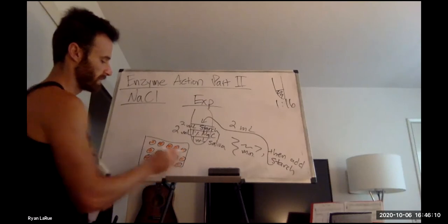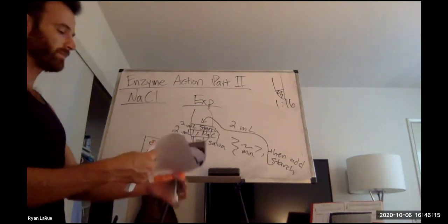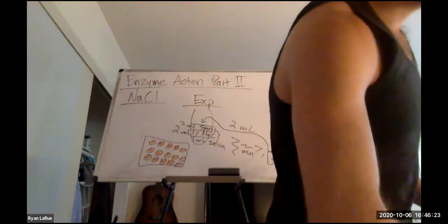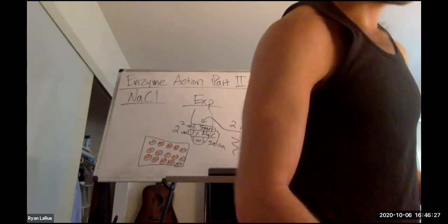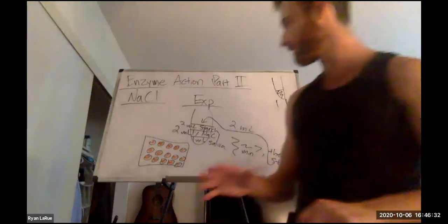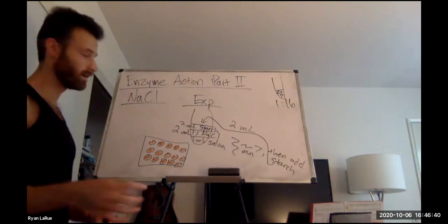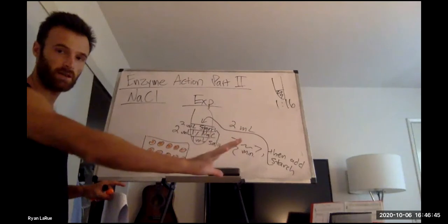I should also mention, you'll see this when you look at Stacy's data. The first row, she does either the positive or negative control. What does she do? Oh, she does it on the first page. So never mind. Okay. But as far as the negative control, no enzyme present, right? It was just water. So that's a good negative control. There's no enzyme in the water. And it would all turn black. No starch being broken down. That's a good negative control.